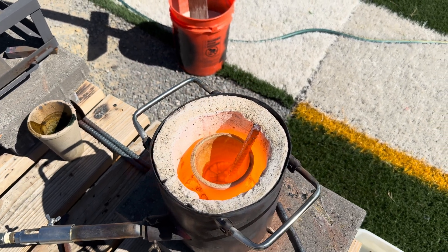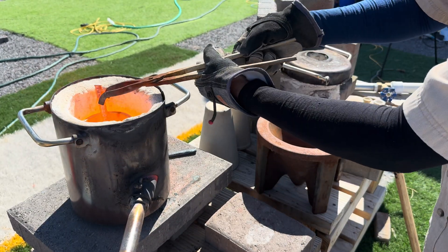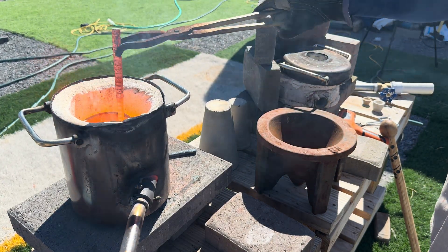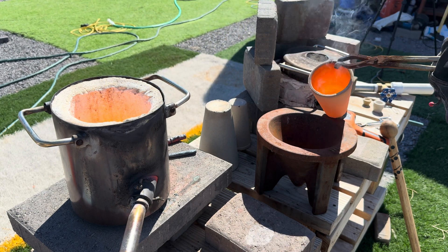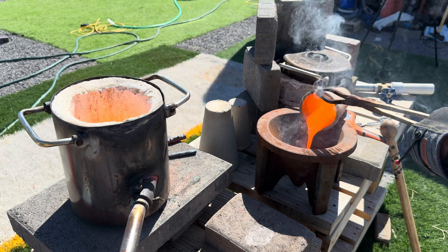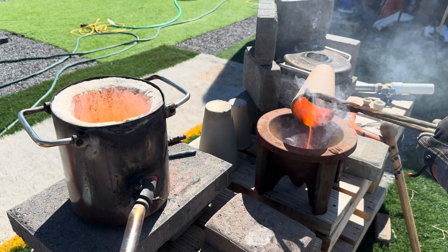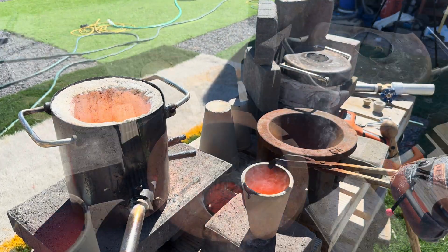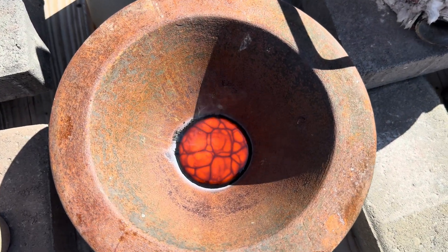We're now at 2,000 degrees and we will let it cook for the next 25 minutes. If you watch the pour as we slow the video down, you can see the lead coming out of the pour. We will allow the cone to cool off for an hour.